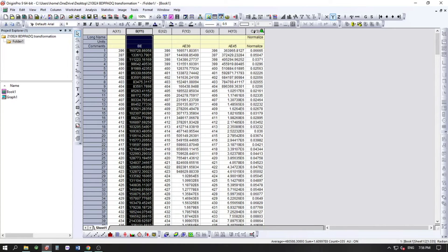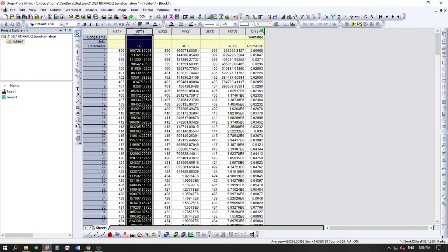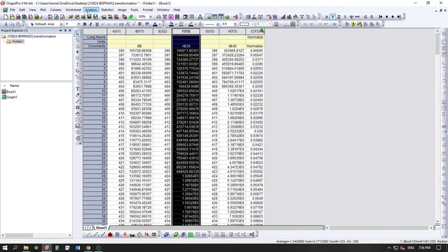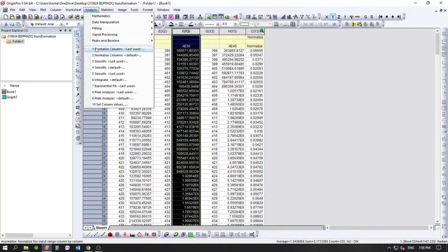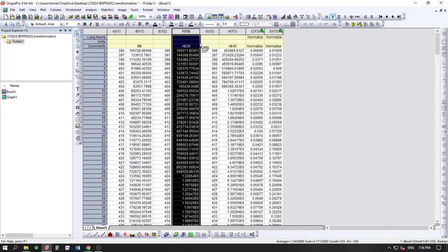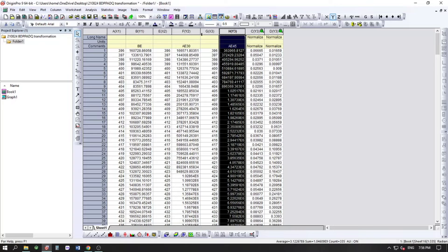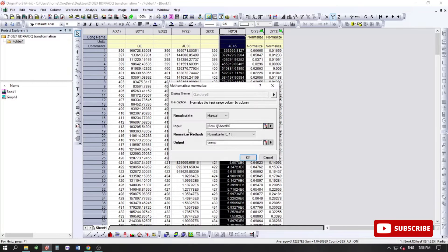Click OK and the normalized column is generated. Similarly, we do this for the second column — Analysis > Normalize Column, Last Used — click OK. Then for the third column as well: Analysis > Normalize Column, click OK. So now we have three normalized columns.